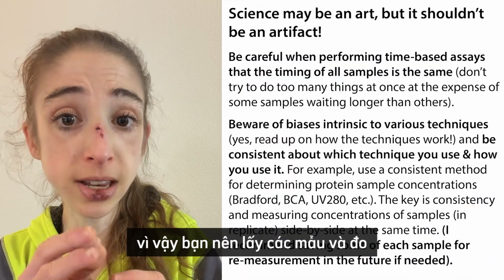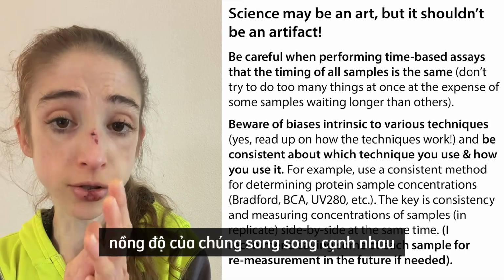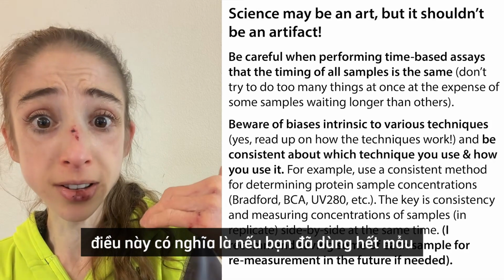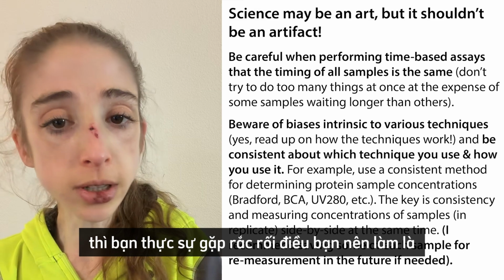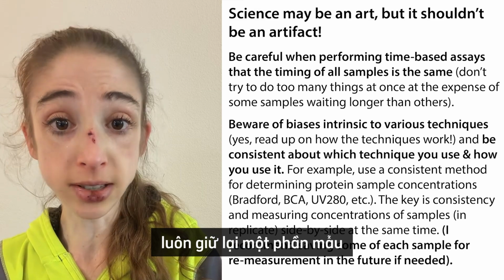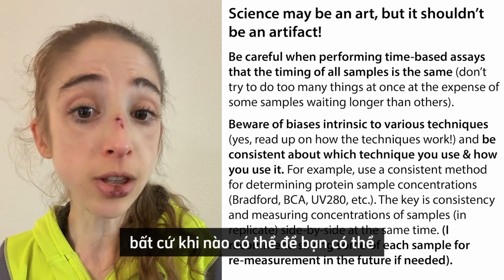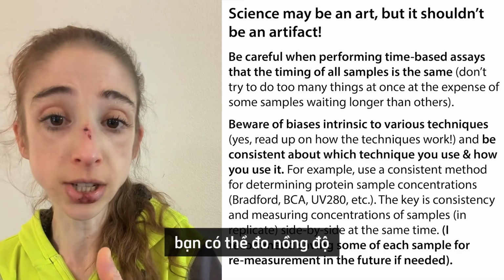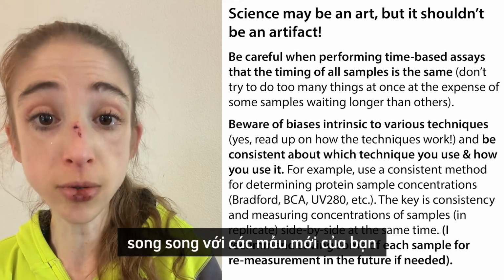And so you want to take your samples and measure their concentrations side by side. Now, this means that if you got rid of all your sample, you're kind of screwed. What you want to do is always save some of your sample whenever possible so that you can do repeat experiments in the future. You can measure the concentration side by side with your newer samples.